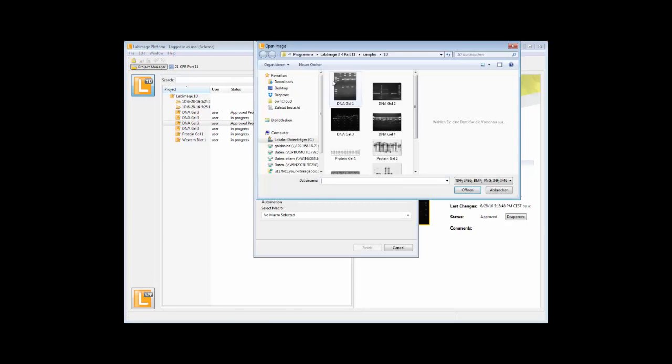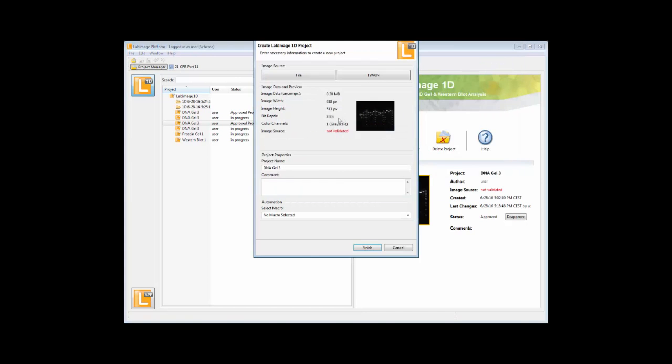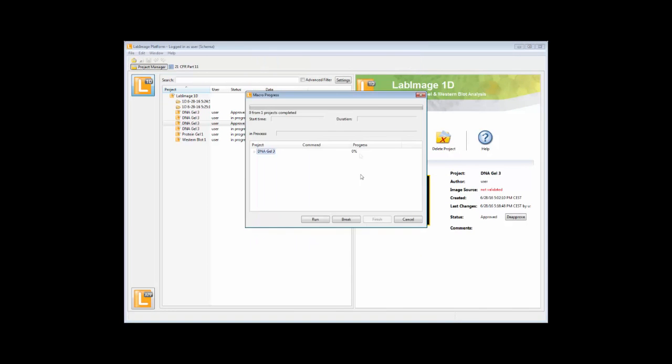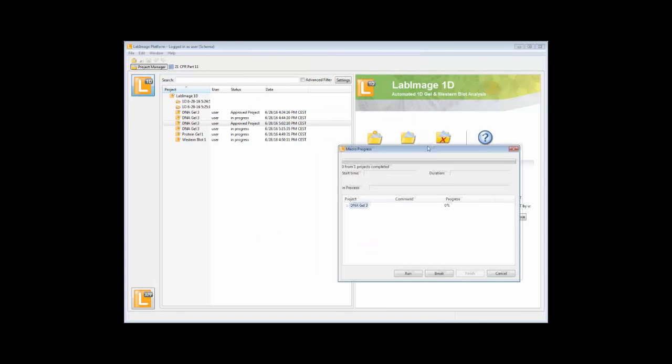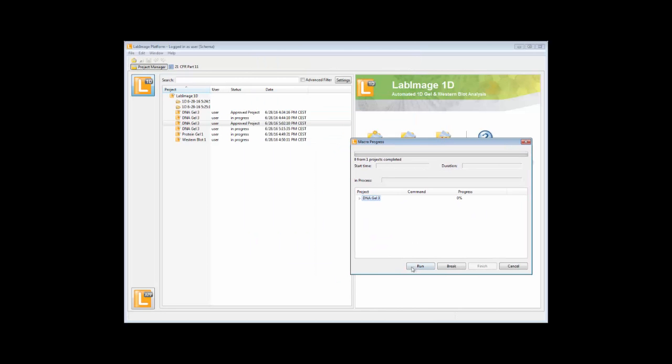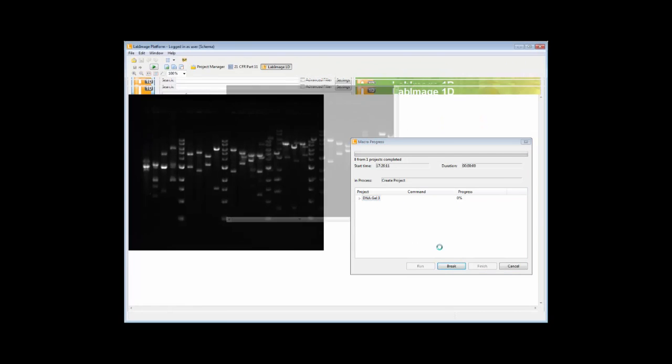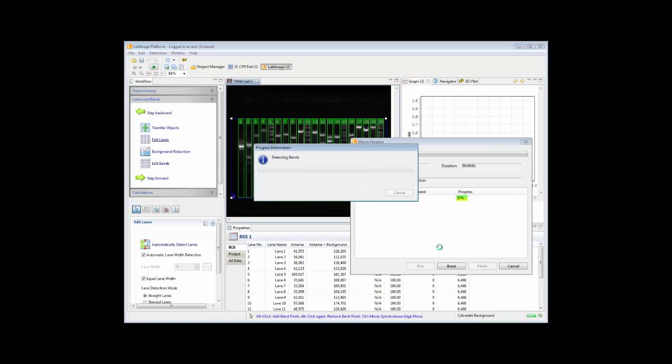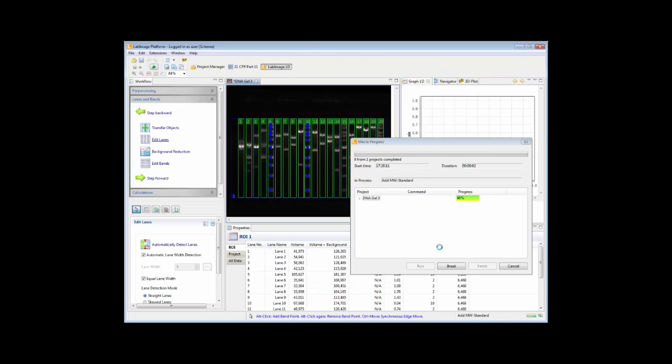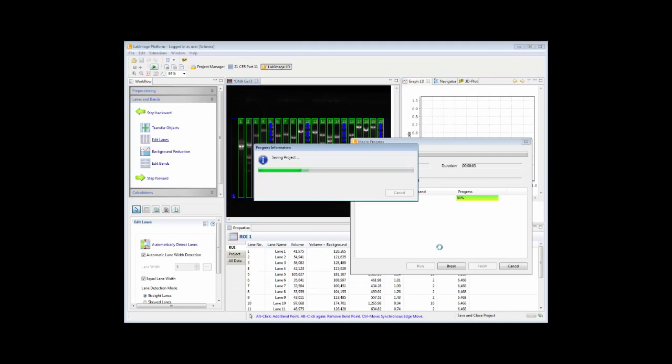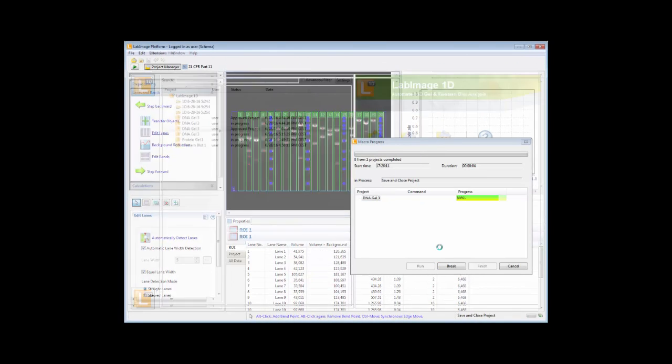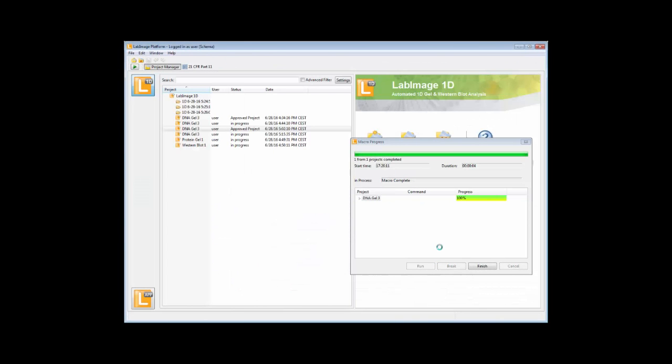Load up your gel, load a predefined process, and this process will execute all the single steps that you have defined. This is loading the image, defining lanes and bands, applying a molecular weight standard. This is the speed of LabImage 1D, even under Part 11 compliance.